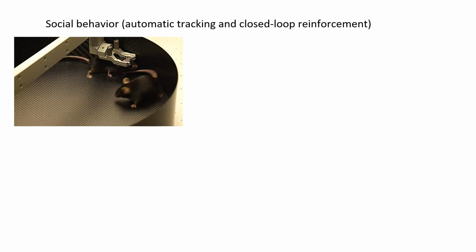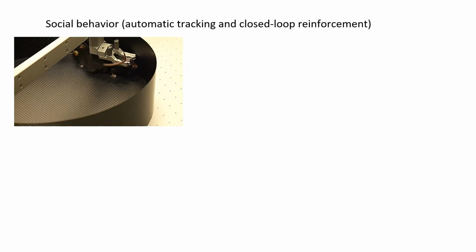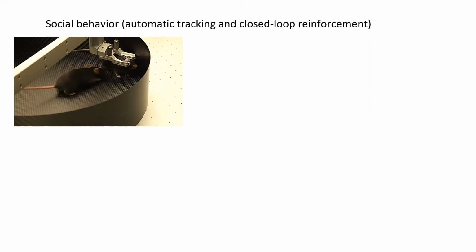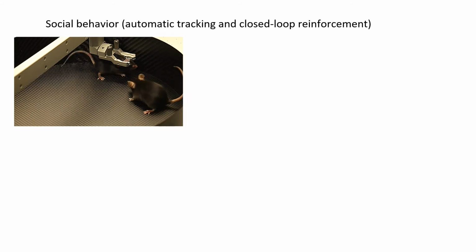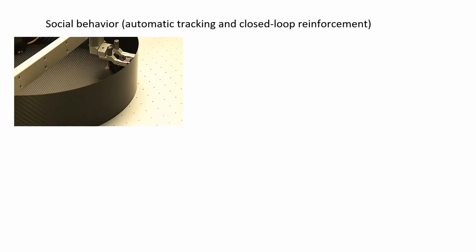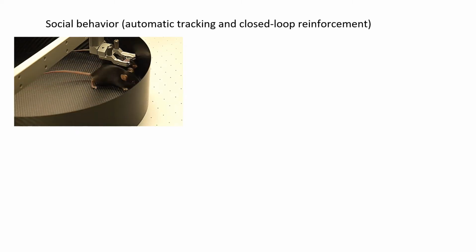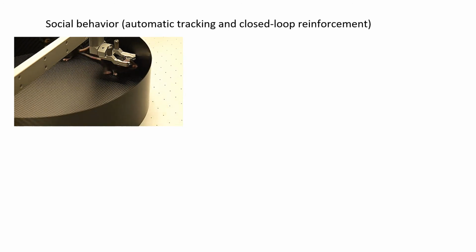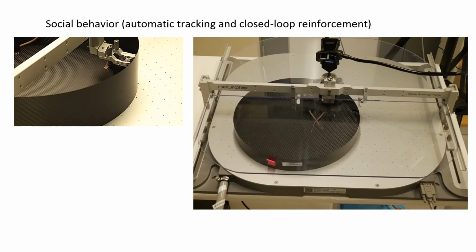An important part of our behavior, both conscious and unconscious behavior, is the sociability, the ability to interact with other human beings. And for the mouse, it's the ability to interact with another mouse. And as you can see in these slides, the mice can interact with each other while one of them is head fixed, and we can record or image from individual neurons and circuits of neurons in the brain of that mouse, and then correlate it with the kind of interaction that it has with another mouse.